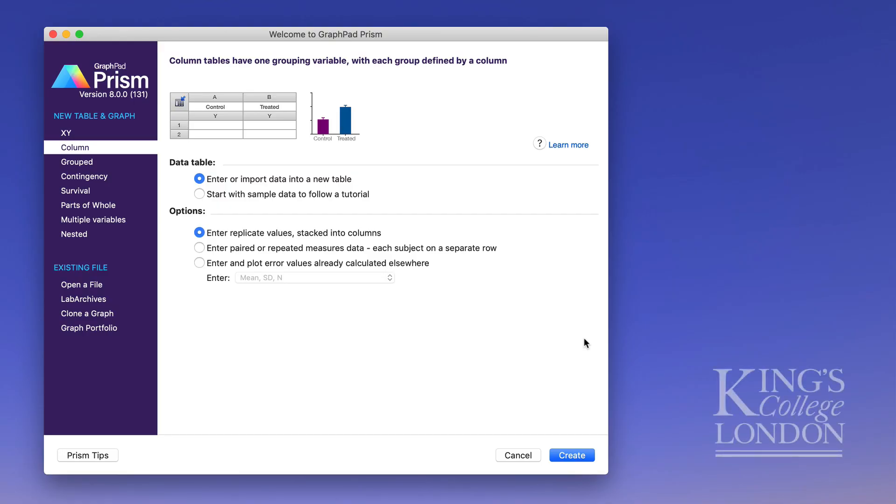Hello, in this brief tutorial I'm going to go through the steps required to do a student t-test in GraphPad Prism. For this example I'm using Prism version 8 on a Mac.